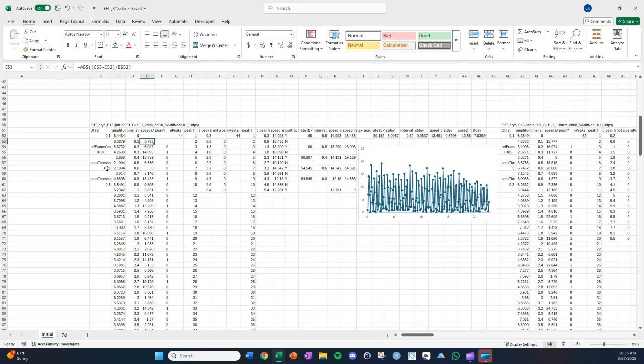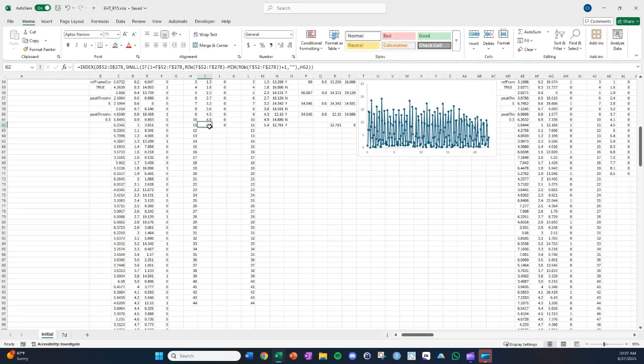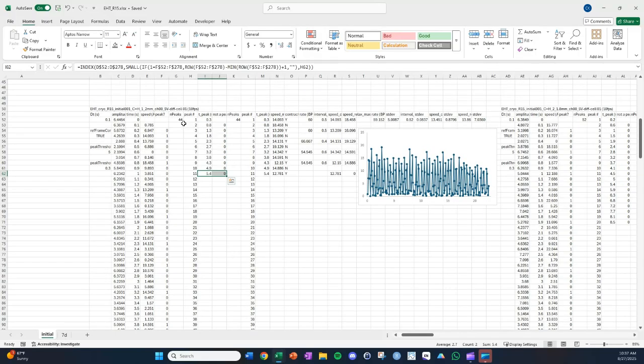But anyway, what I was trying to get to before that explanation was these two parameter values and why you might change them. So looking at this graph, it looks like these parameter values are good. The reason I say that is if you count these peaks, I'm not going to count them now, there are 44 of them. So that's one way you can tell if it's good, is if there are 44 peaks showing.